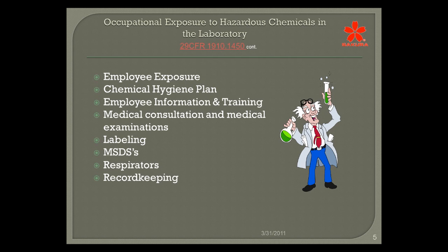When I talk about employee information and training, before you even go into the laboratory, you actually have to have training associated with the hazards that are going to be encountered within the work that you're going to be doing. You can't just take someone that's never worked in a laboratory, shove them in there and say, here you go, good luck. They need to understand what the permissible exposure limits are, and how you actually recognize exposure. So is it an odor? If I get something on me, will it turn color, like silver nitrate? If I get little black spots all over my hands and I was doing a silver stain, well, guess what? I may have been exposed, because that's one of the indicators that you actually got some of that silver nitrate on your hands.